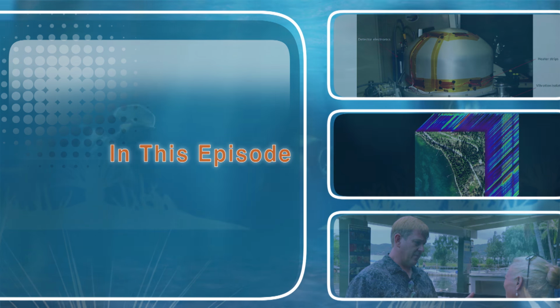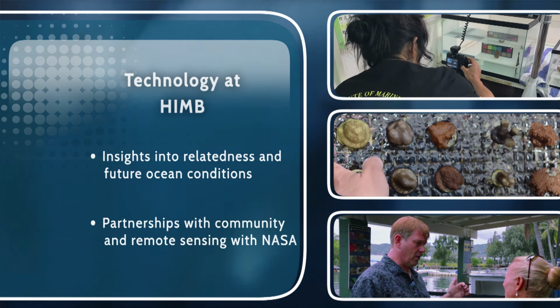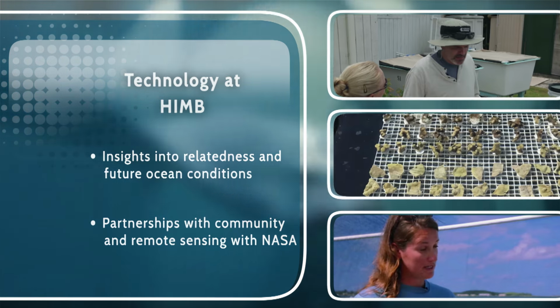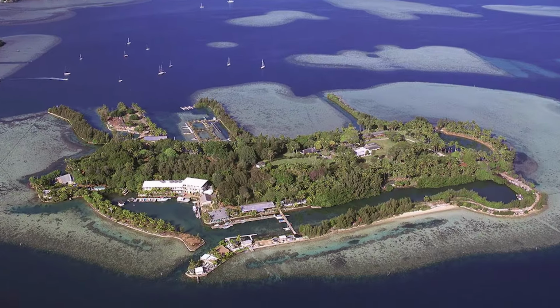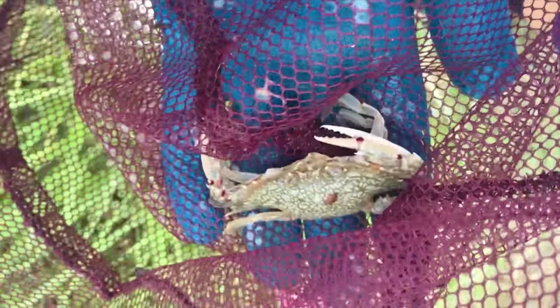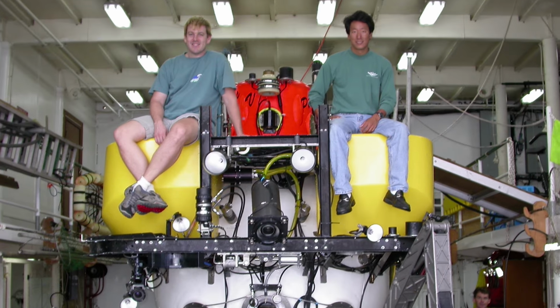In this episode, we're learning about the technology that researchers at the Hawaii Institute of Marine Biology use to study genetic relationships, conduct long-term experiments, and remotely assess the health of coral reefs. The location of the Institute within Kaneohe Bay is key to understanding our island populations of coral, fishes, crabs, sponges, and other organisms. Lead researcher Dr. Rob Toonen describes why.